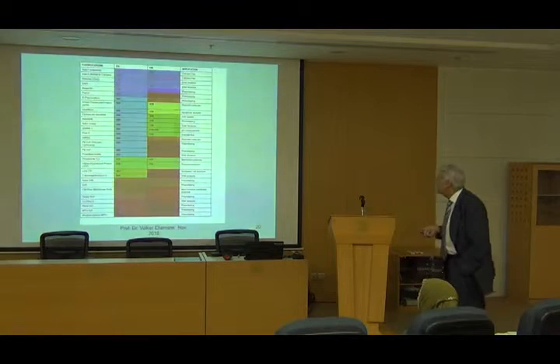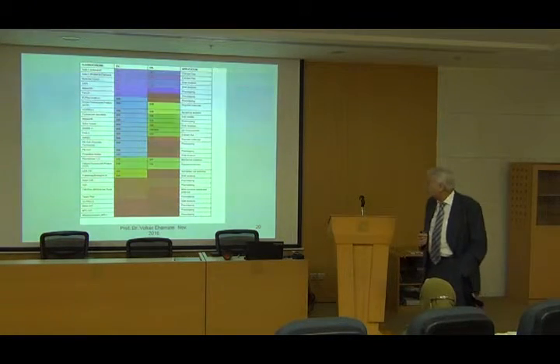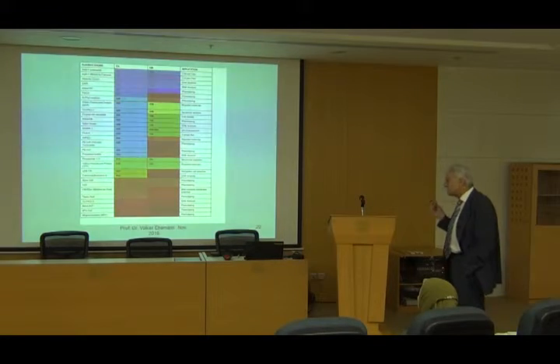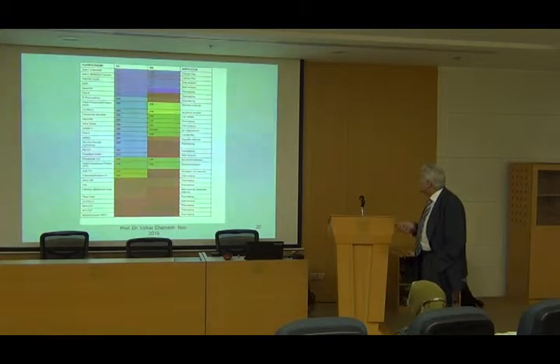And you see here a lot of fluorochromes which are common for analysis of cell cycle, surface antigens, and so on. And you see here the excitation.